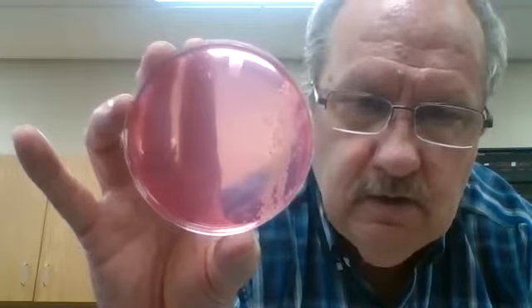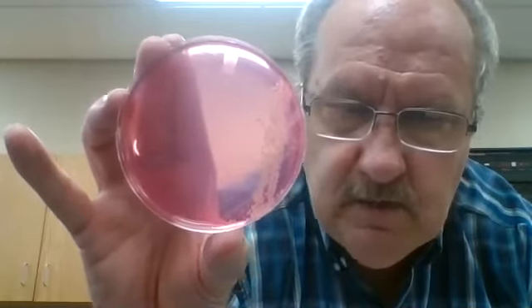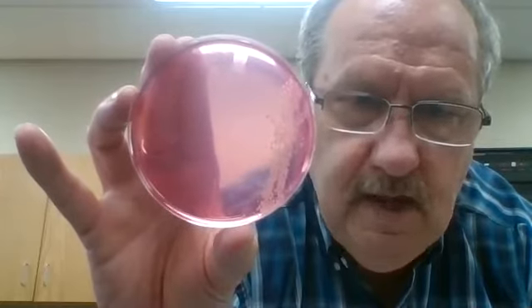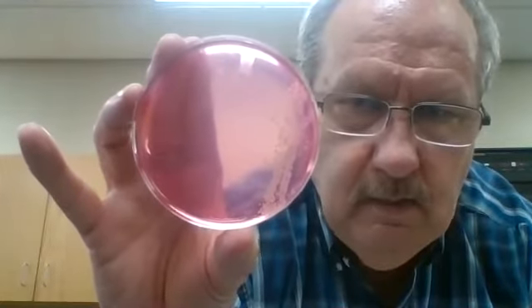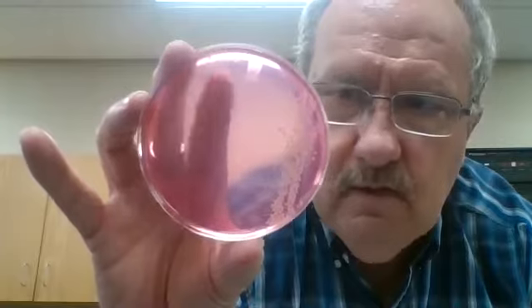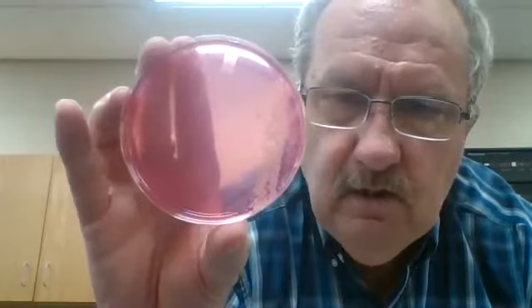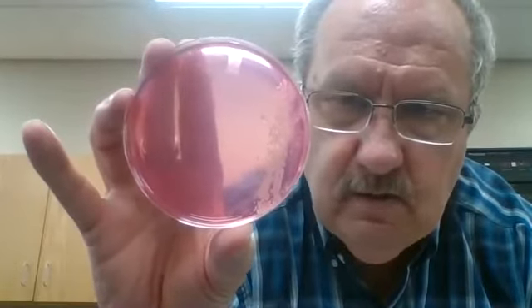I did not culture Staphylococcus aureus from my skin, which is surprising because I've been known to carry staph. I'm really surprised it wasn't on my nose — I just had a really clean nose that day. So no mannitol fermentation, no Staphylococcus aureus.